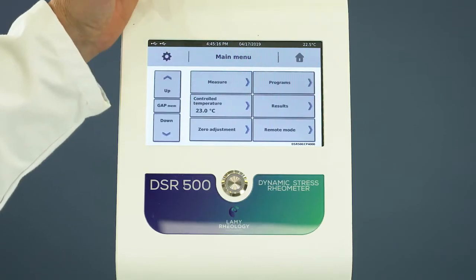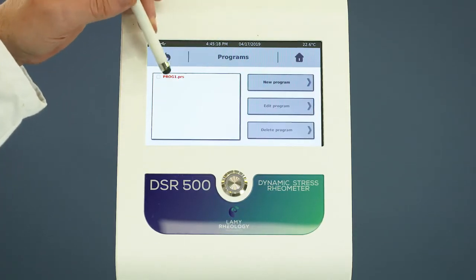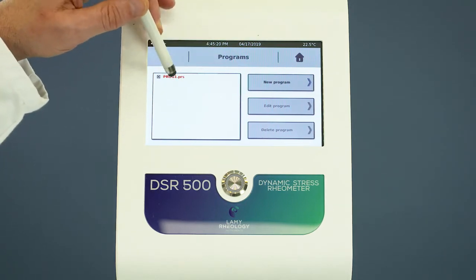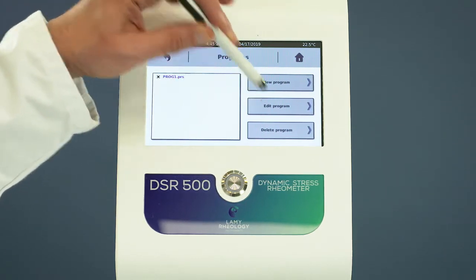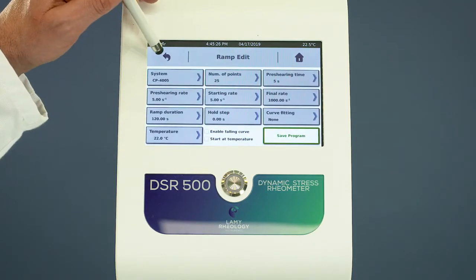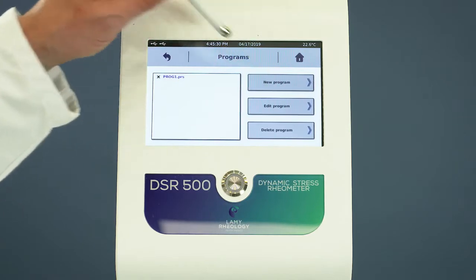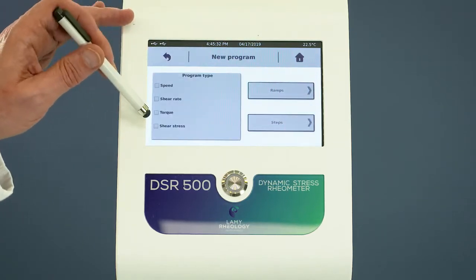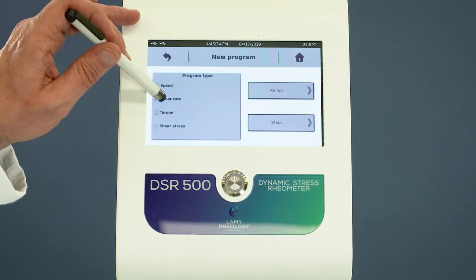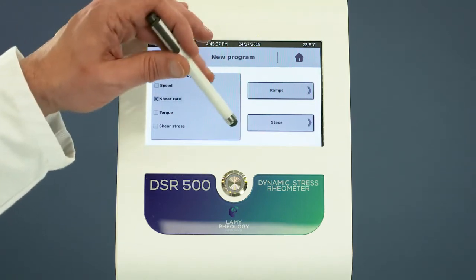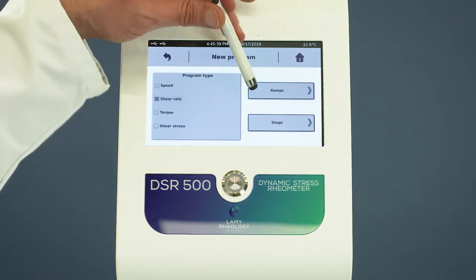Select programs to create, edit, or delete a method. Select new program. The rheometer can set the ramp or step program for the speed, the shear rate, the torque, or the shear stress.